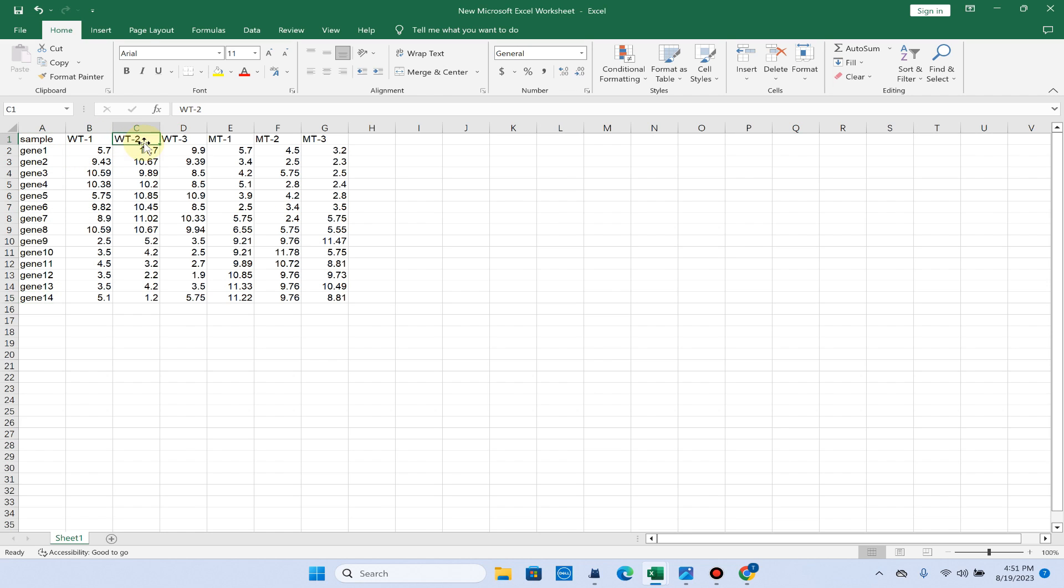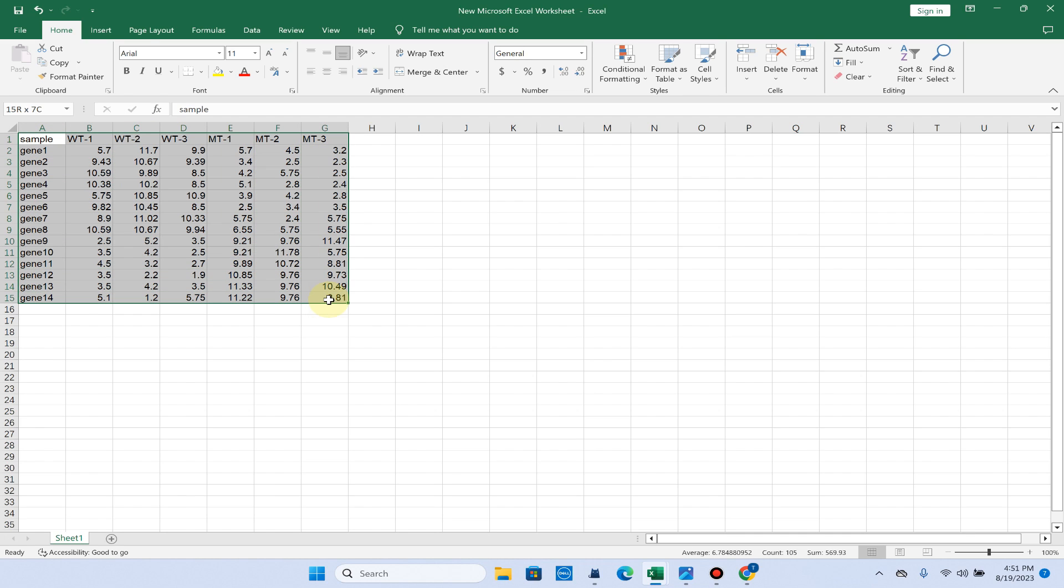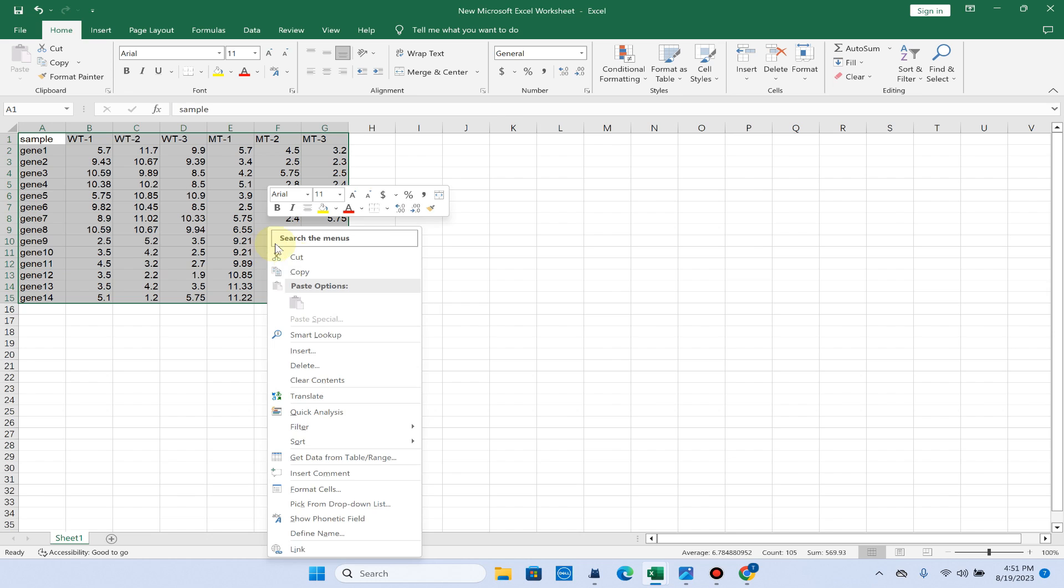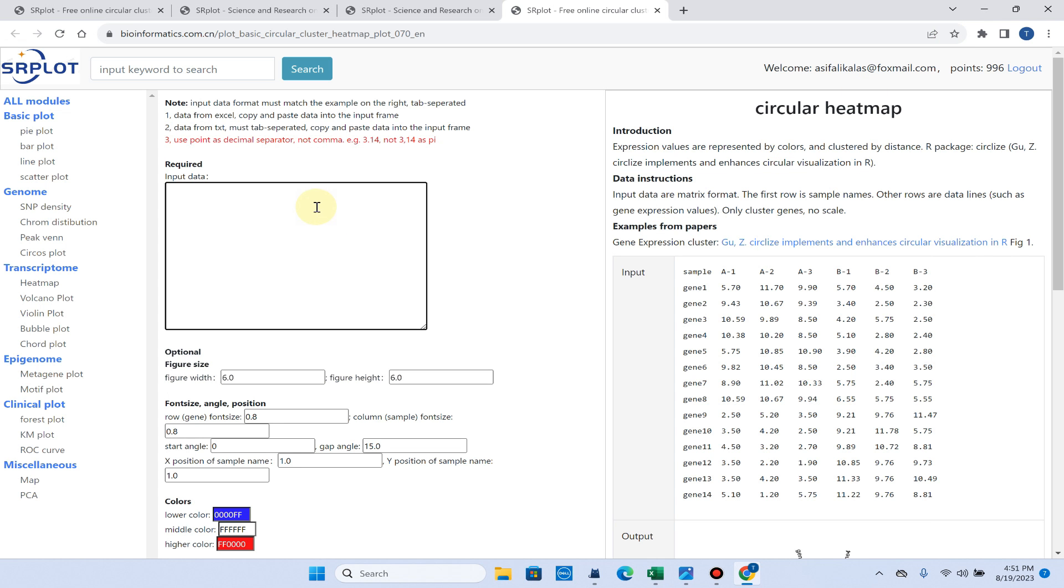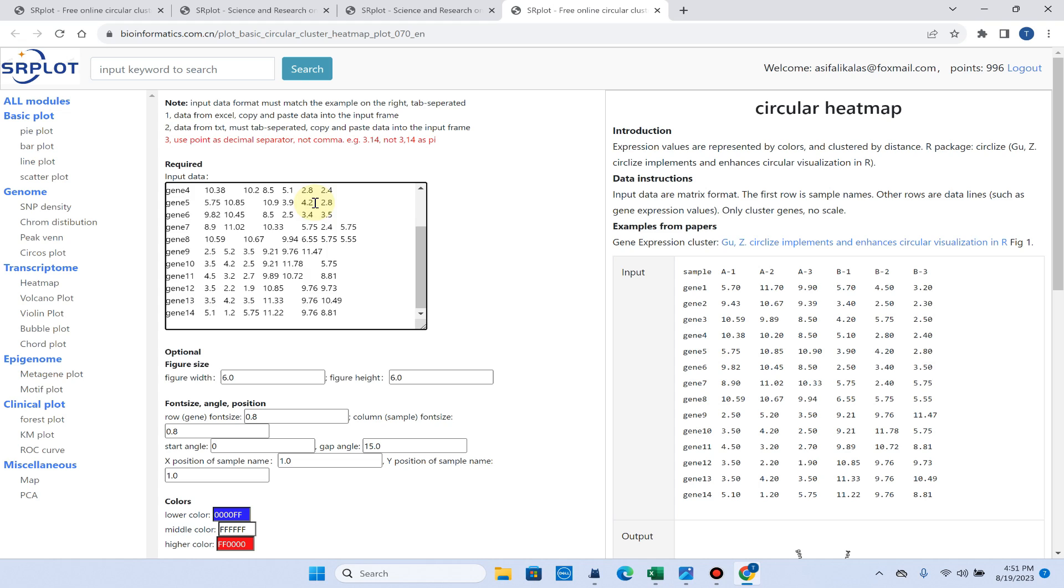Here you can see I have 3 replicates of wild type and 3 replicates of mutant type. You can put your data in this format and simply copy all these expression values or fold changes values and directly paste them in this input data box.